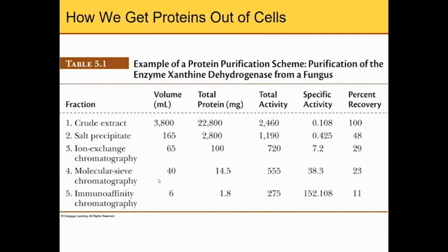And this is just an example of a protein purification scheme, to show you the amount from the crude extract and the total protein.